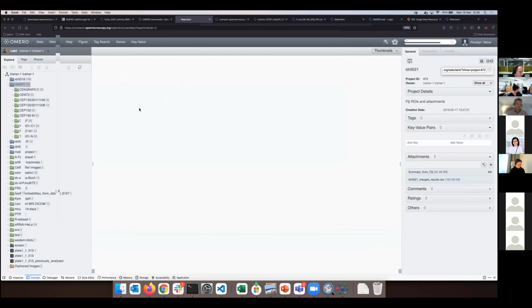There was no such thing that you would have to download everything. You can also put the analysis closer to the images, using another analytical machine next to the data or close to the data, and we can discuss such things as well.